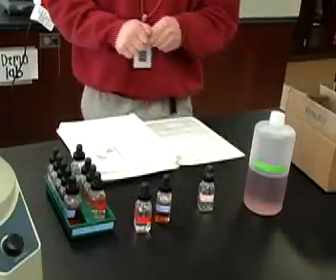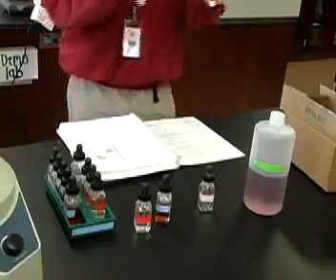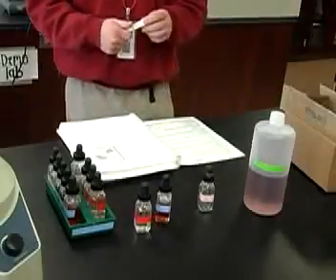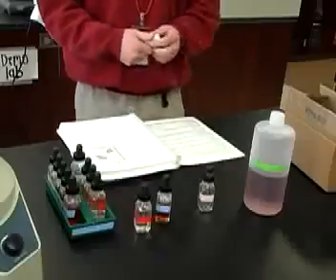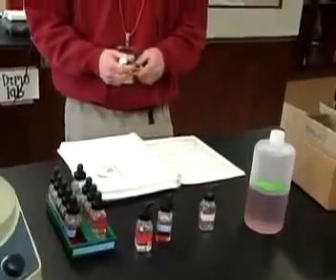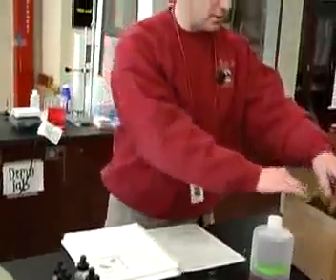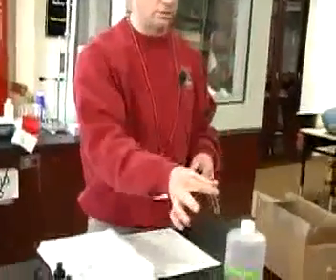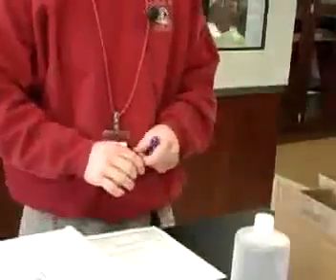I suggest using distilled water because then it doesn't leave scale on the inside of your glassware. And we only use a hot plate too because then you don't have flames around either. With your test tubes, when you heat them, then you'll put it into a test tube holder, and then you just put that test tube into your hot water bath.